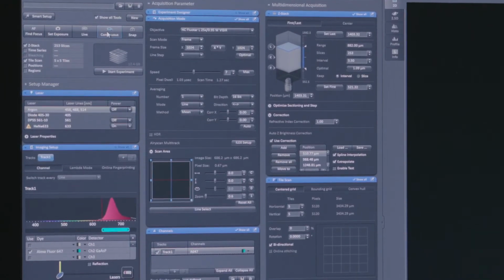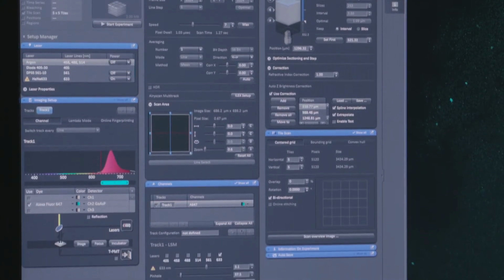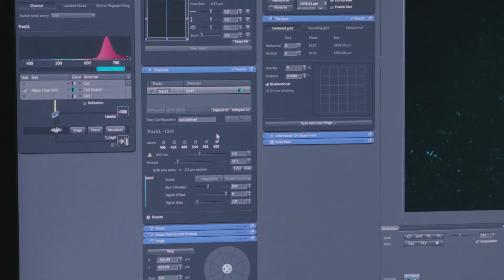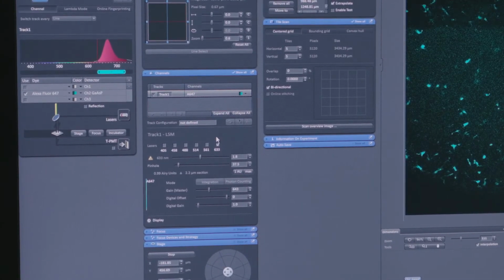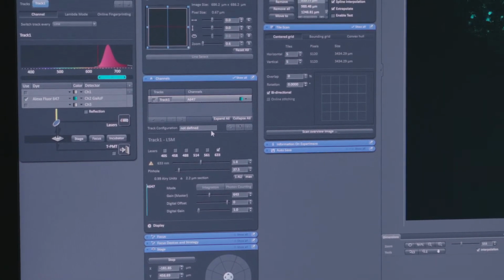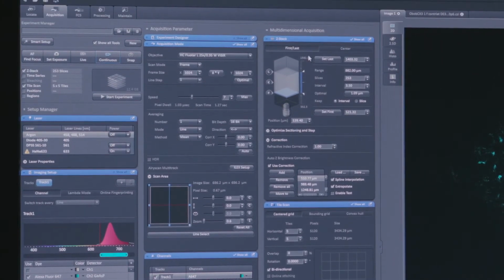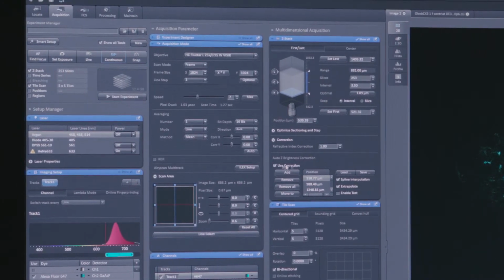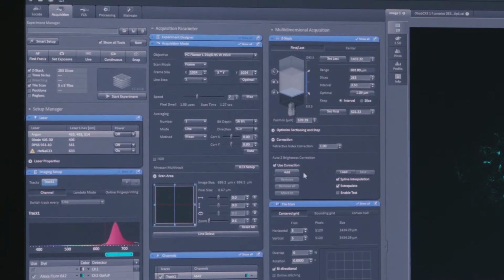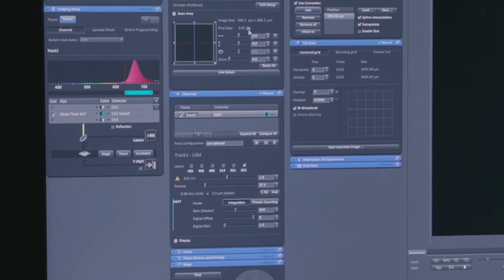For example, in this case, with the Dye system, you can simply go to the surface again of your sample. So we're doing this fast, quickly. And it starts from here, right? When you are in your Z-stack function, you will see that you will have a correction function like here. And you can add a Z position, a Z of interest, with all the parameters of imaging required, okay?